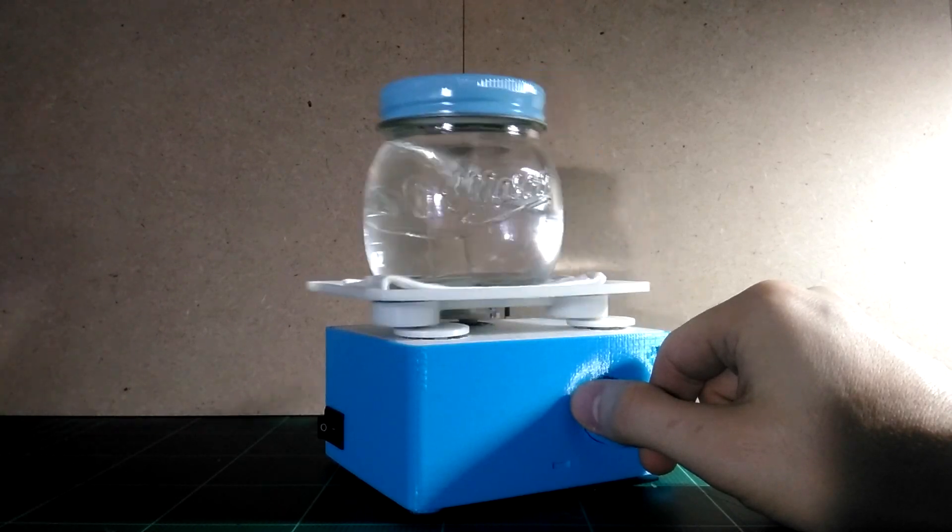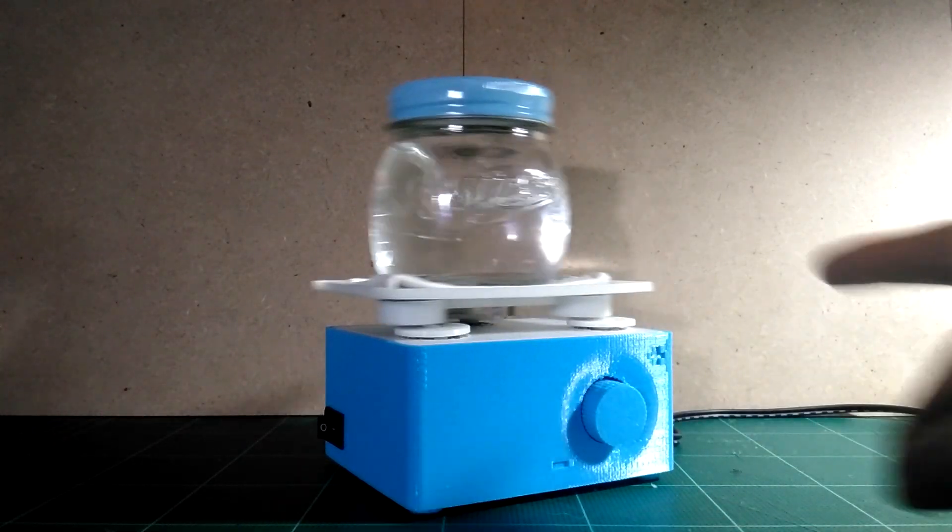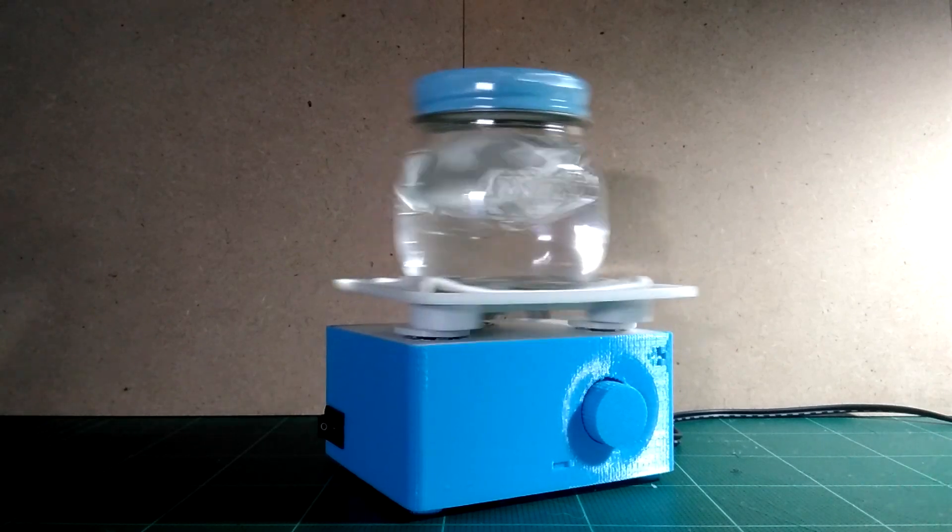Any faster than this with a jar like this, you're going to want to make a customized holder so it doesn't come flying off the platform.